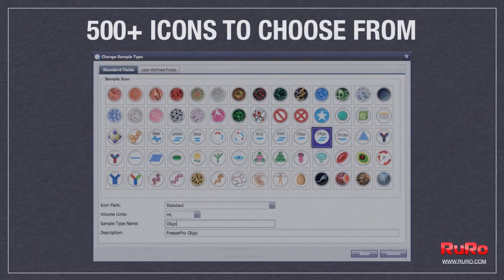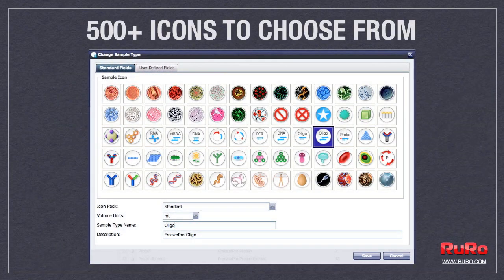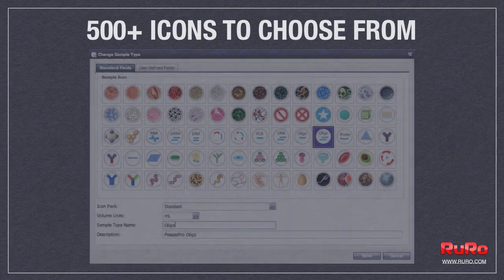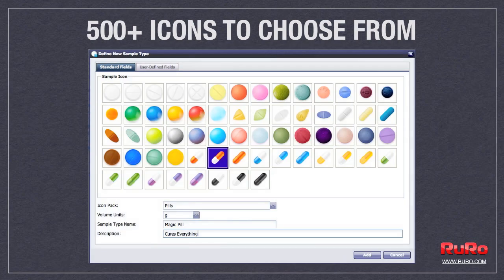Graphic display of boxes with samples represented by a variety of colorful icons makes visual sample identification easier than ever.